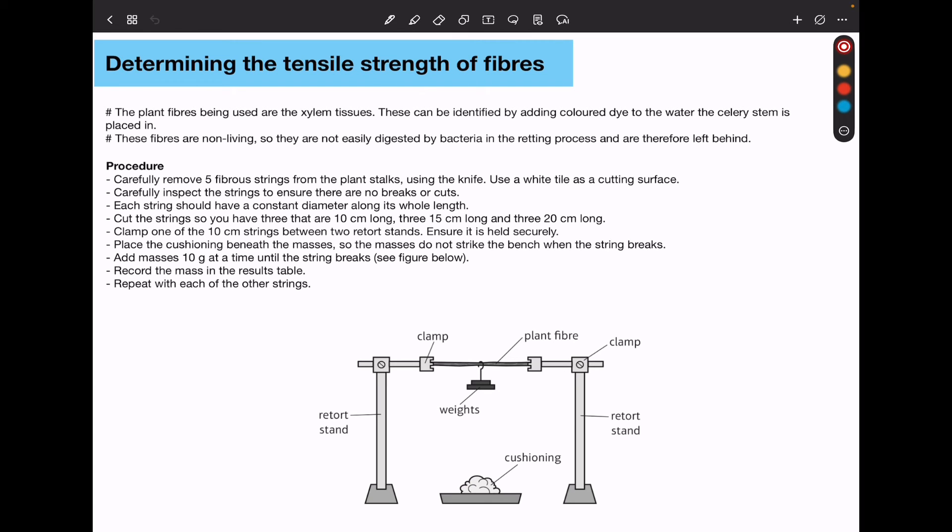Add masses of about 10 grams at a time until the string breaks. Record the mass in the results table, and then repeat with each of the other strings.